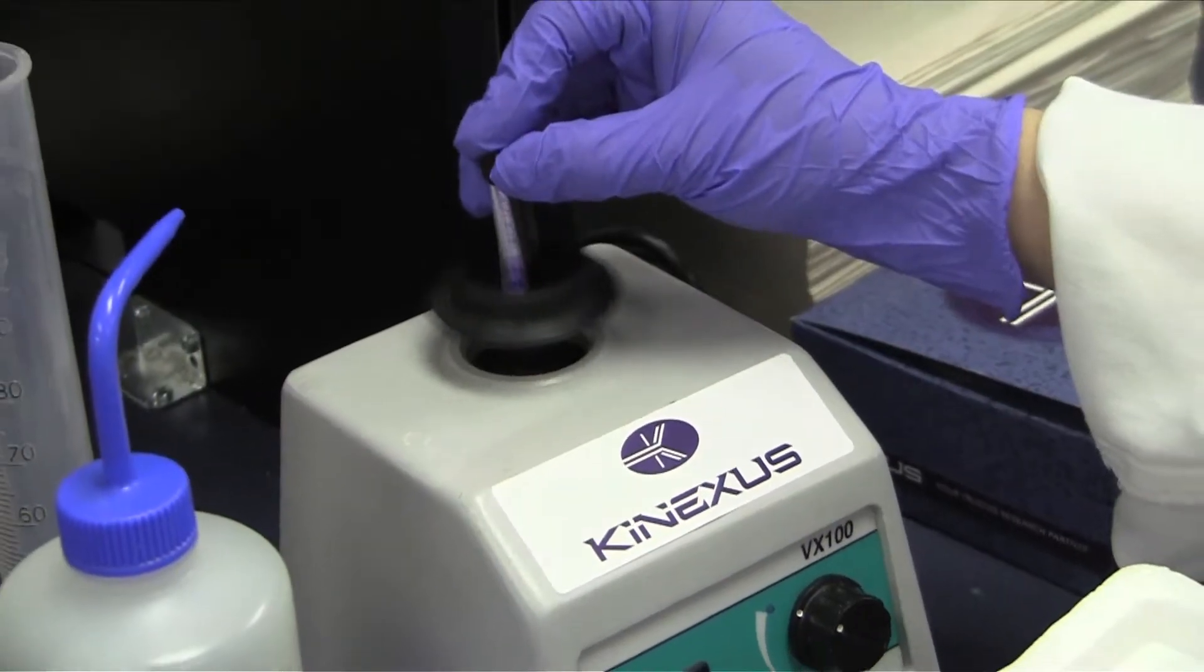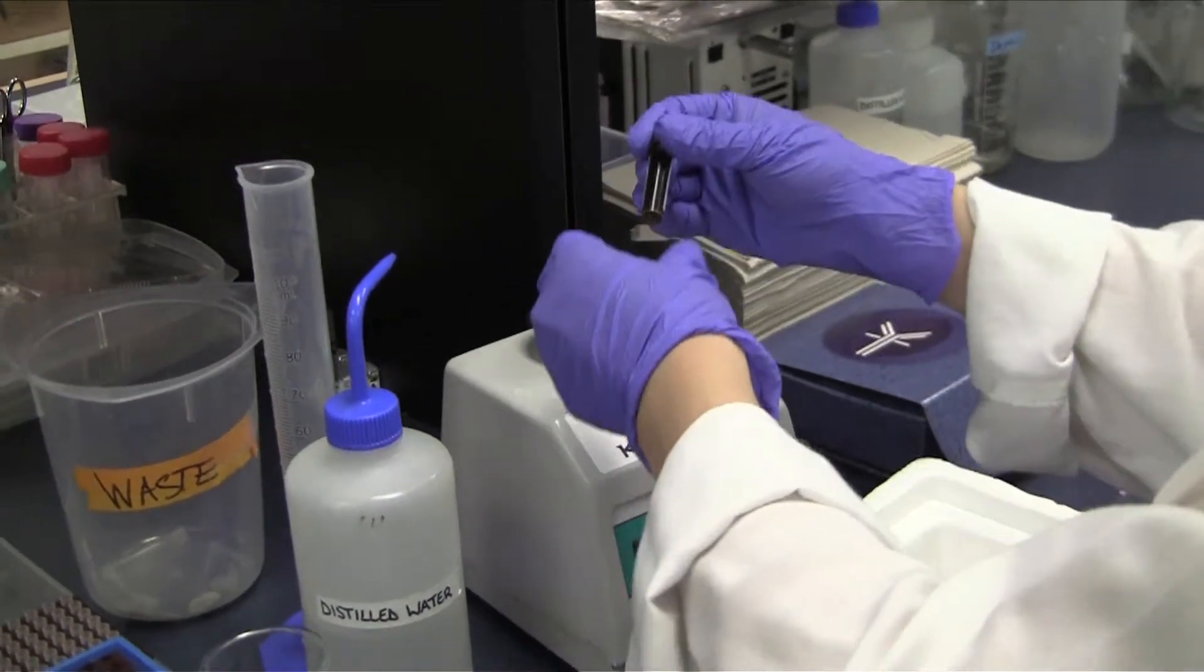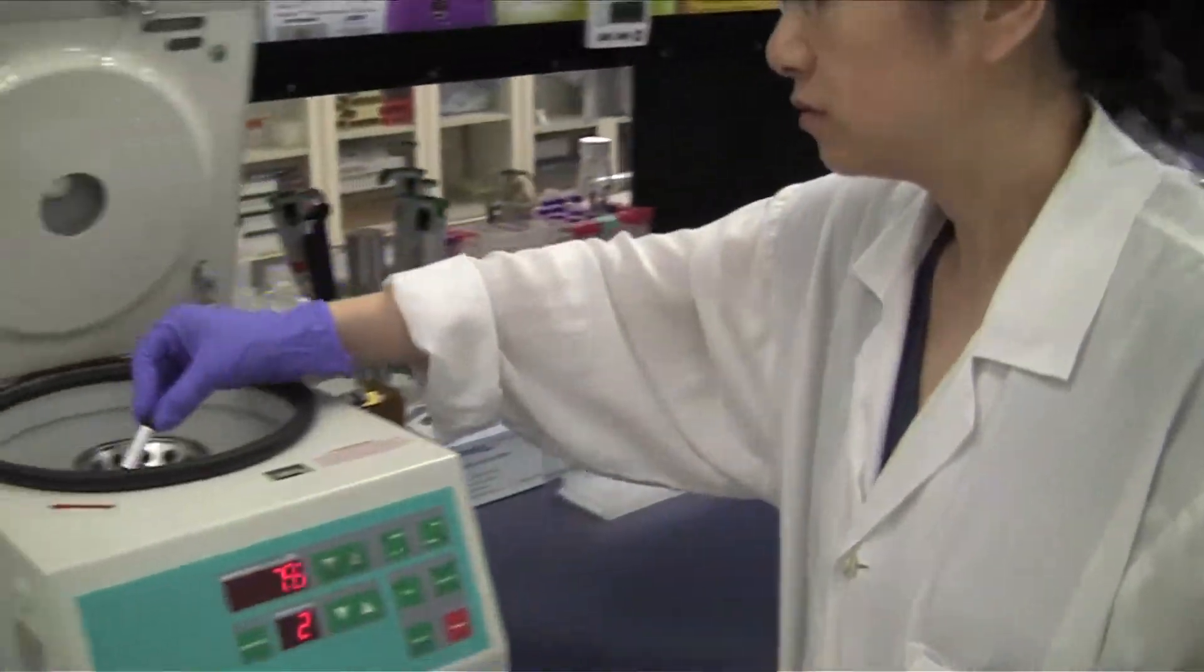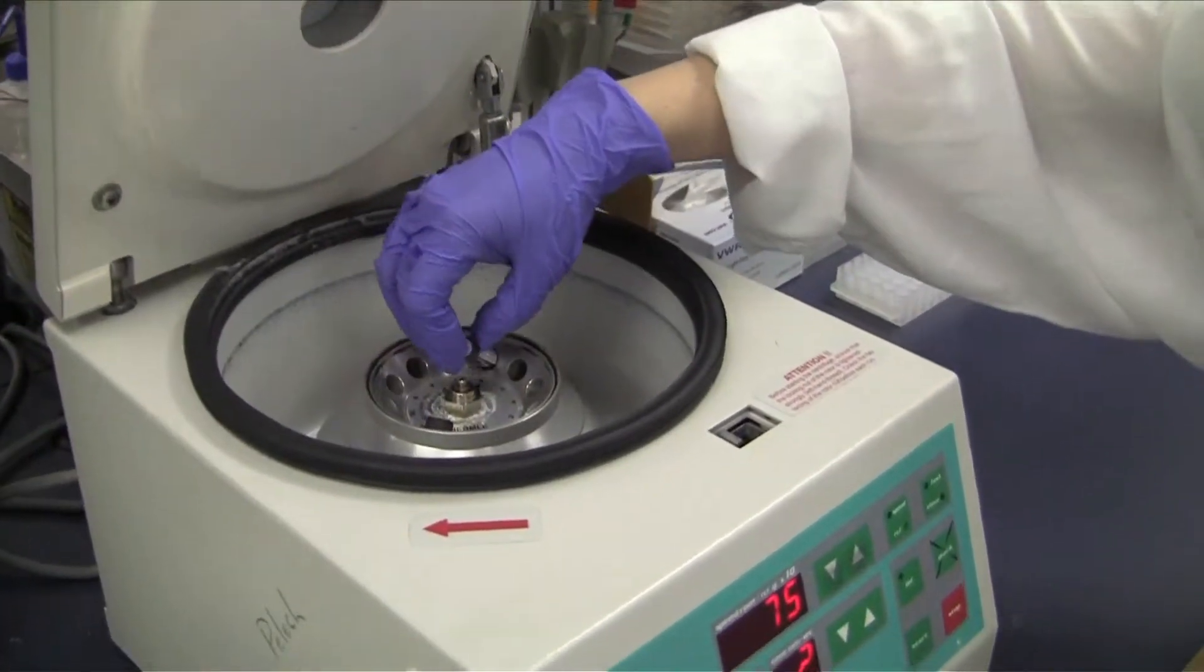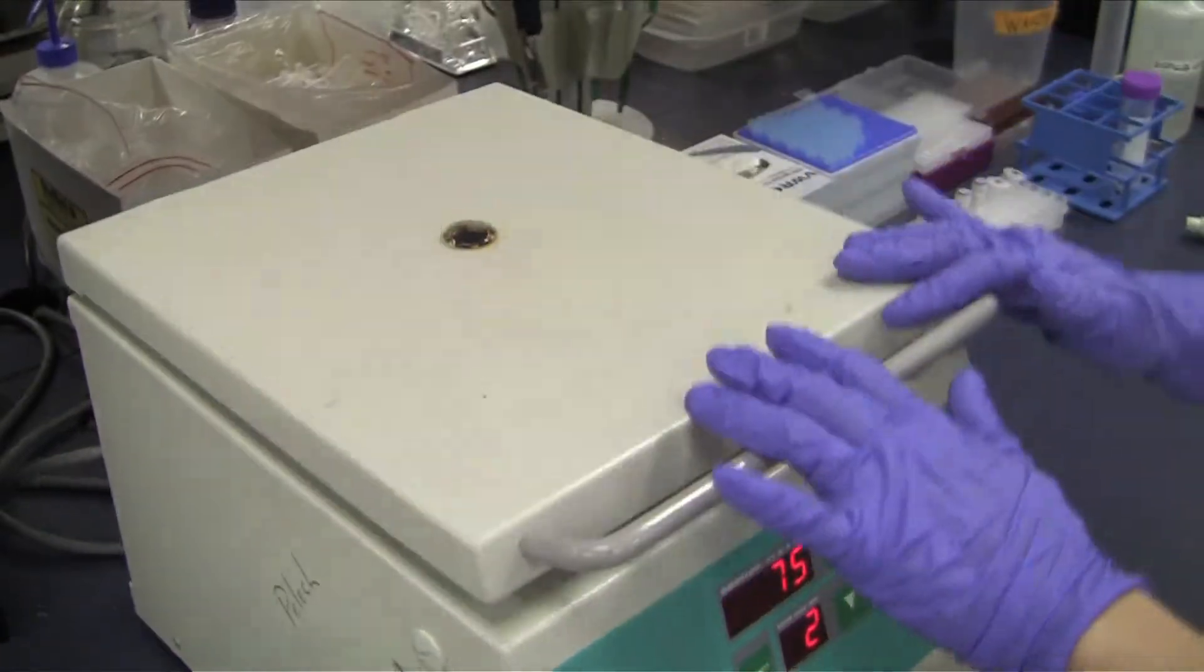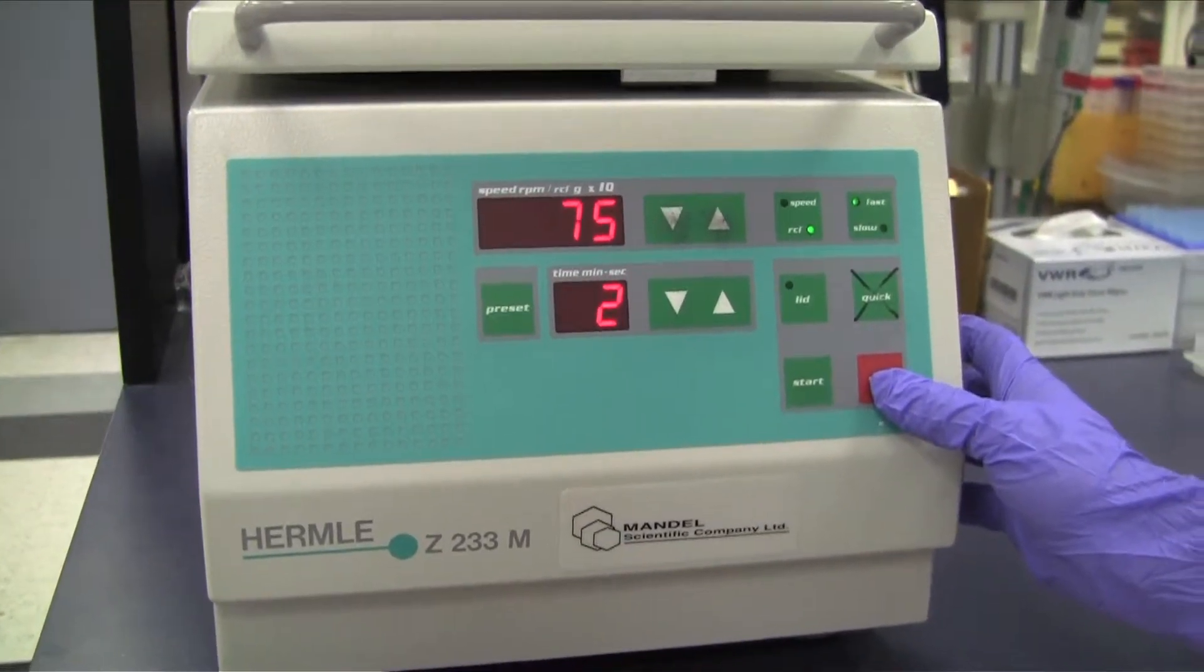Vortex for 30 seconds to completely dissolve the dye. Centrifuge briefly at 750 times G.